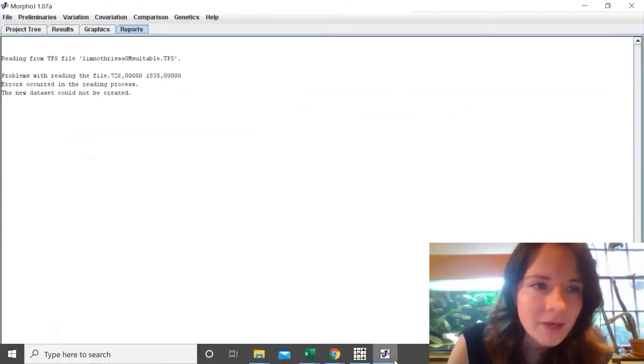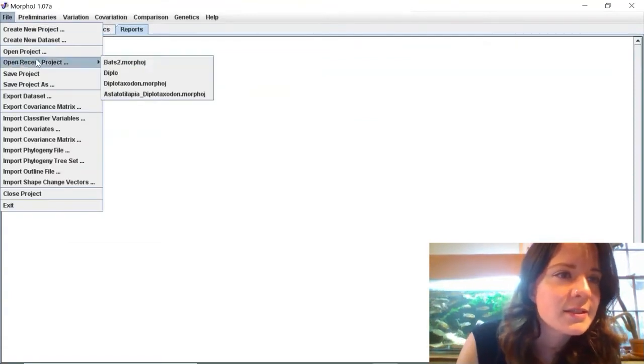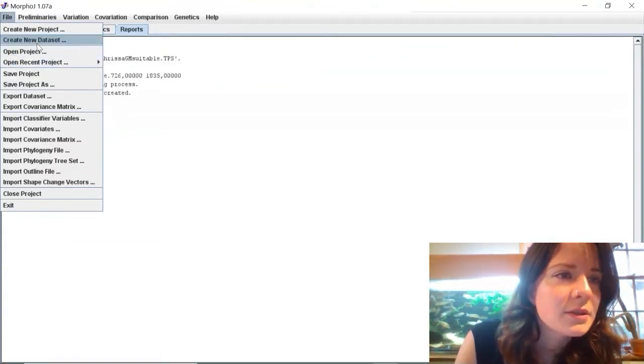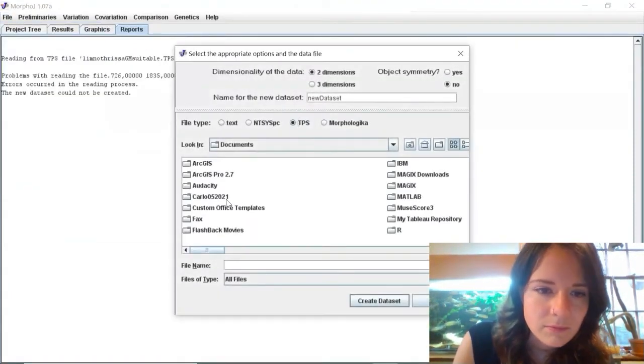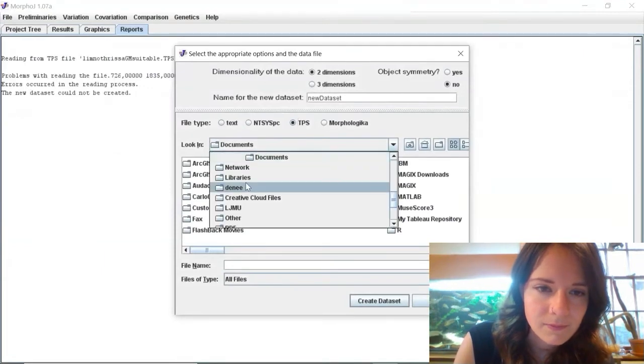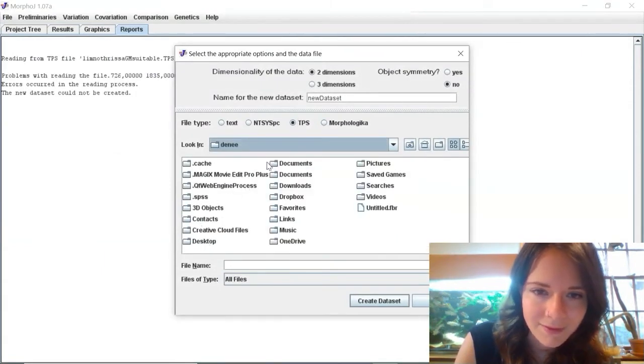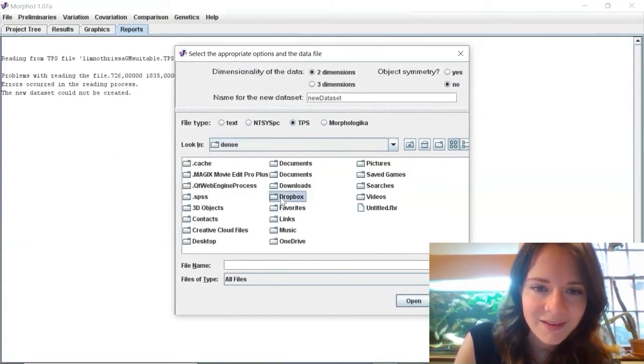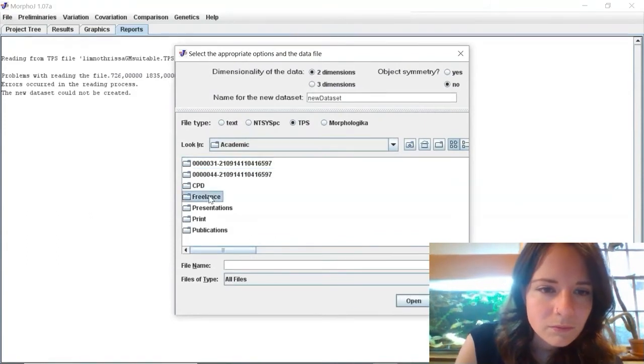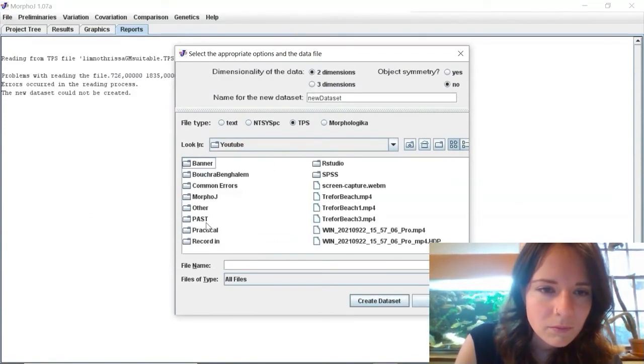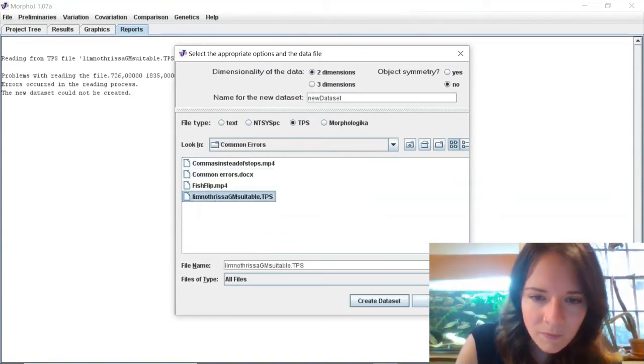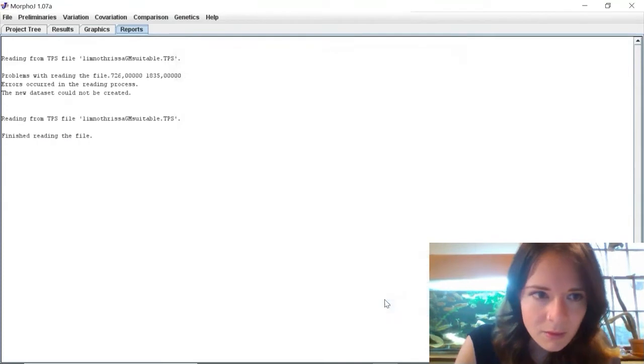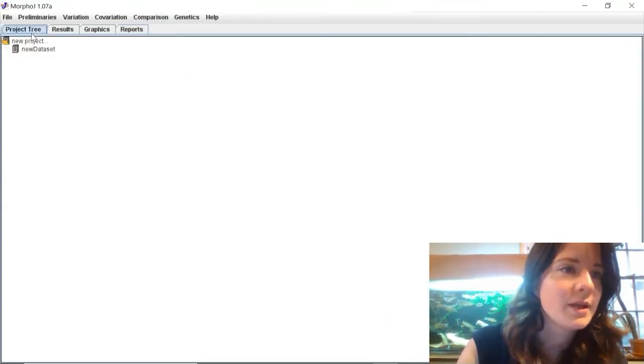So now I'm going to reopen that dataset and you can see it's had no problem opening it.